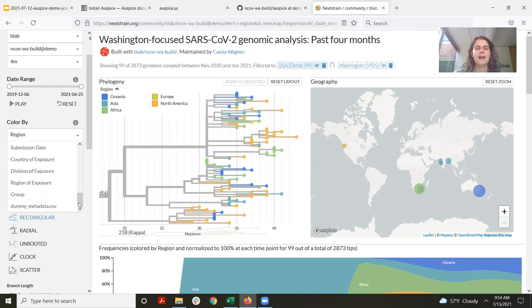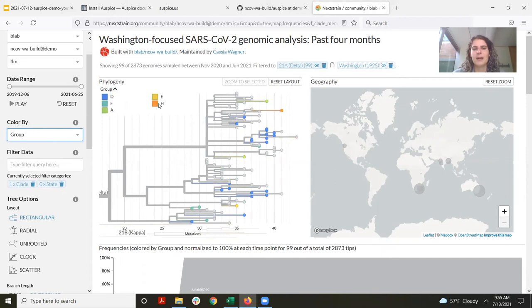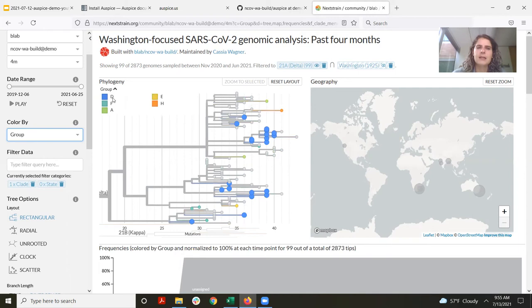Now if I scroll down to color by, I have some additional colorings that weren't available before. The first is the name of the file we used — it shows in yellow anything that was in the file, and in gray everything else. I also have the group column, and it's now showing those groupings on the tree. It looks like a number of the larger outbreaks seem to have been in group D, with more one-off outbreaks in the other groups. It doesn't look like there's a lot of mixing between groups — infections in group D seem to have mostly stayed in group D.